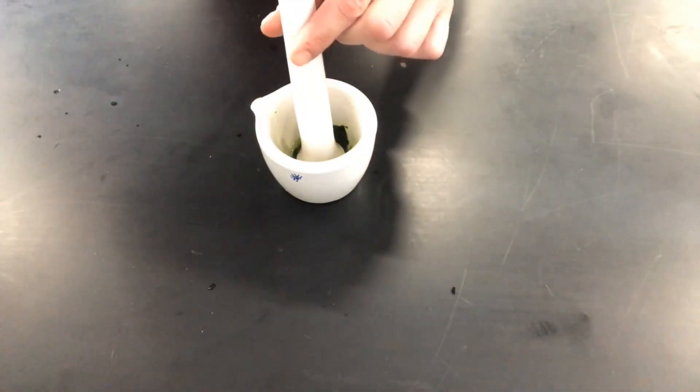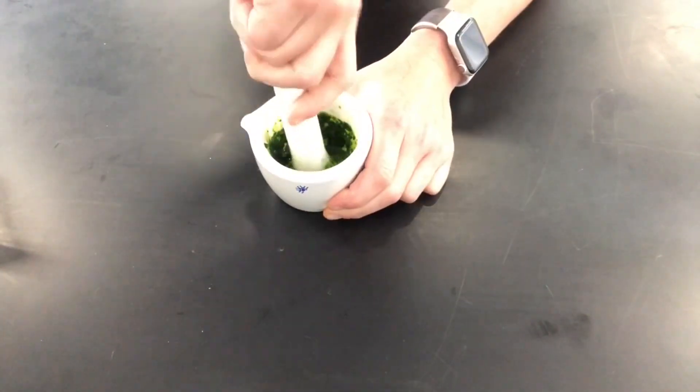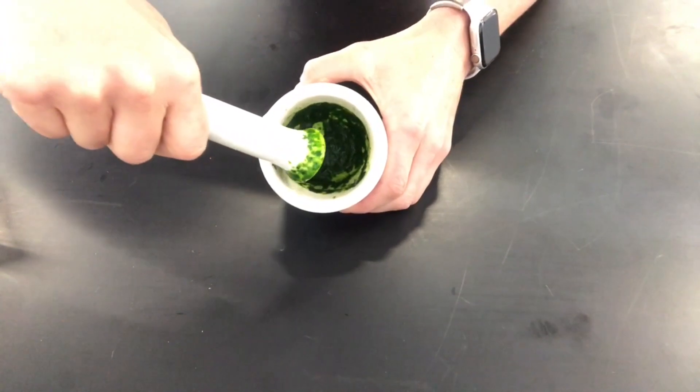If it helps you can add a few more drops of acetone, but ultimately the objective is to obtain a concentrated pigment in a liquid at the bottom of the mortar.